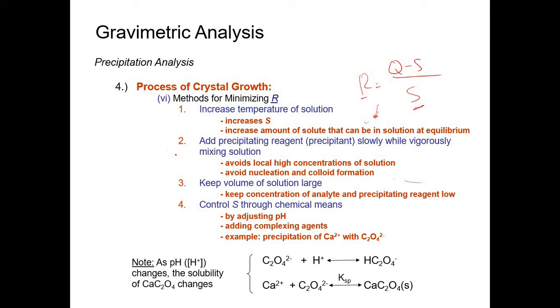Actually it's almost the same as the previous one, where you add the reagent slowly. But the technique here is that they just keep the volume of solution large.